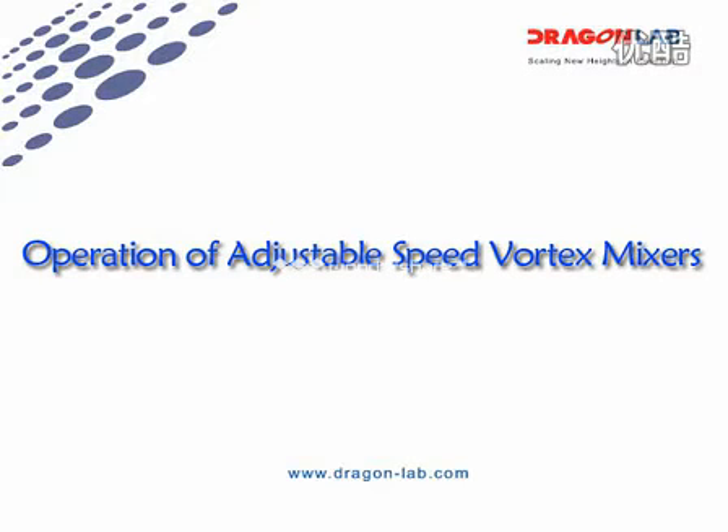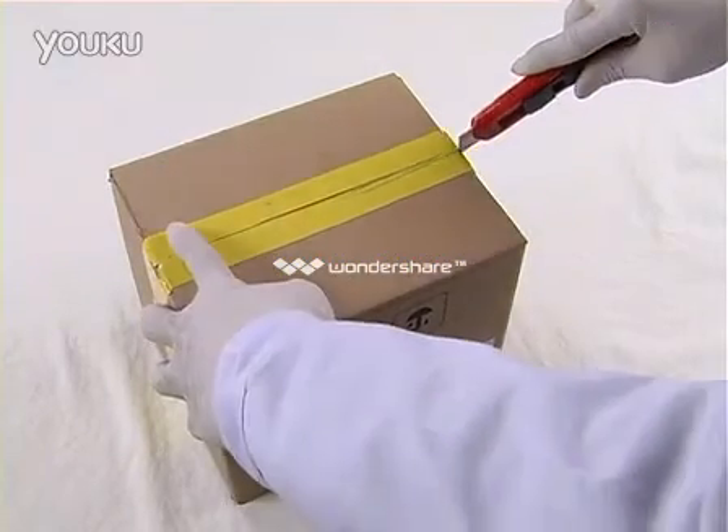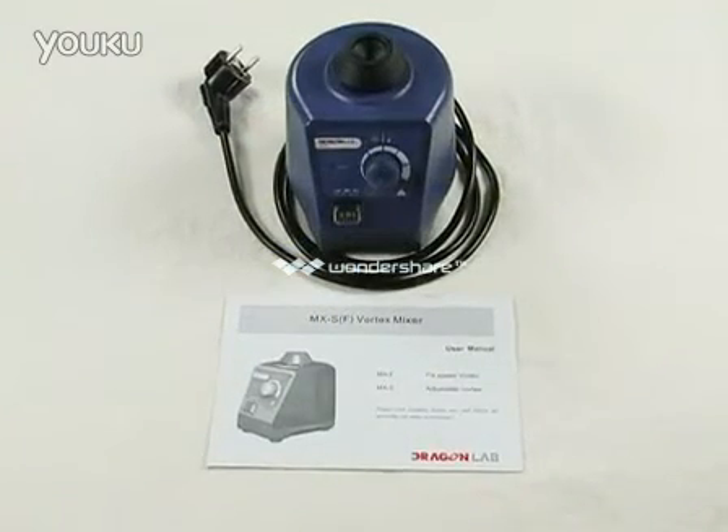Operation of Adjustable Speed Vortex Mixers. Inside the packaging: one Vortex Mixer unit and one User Manual.